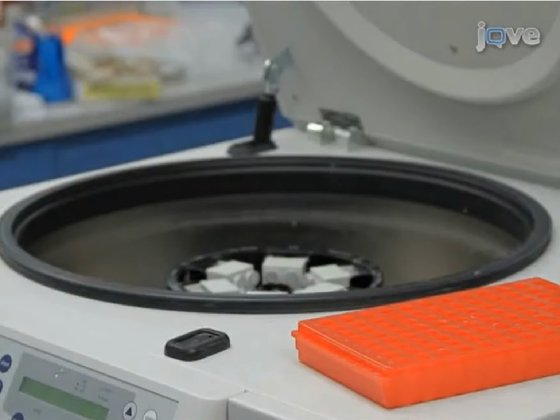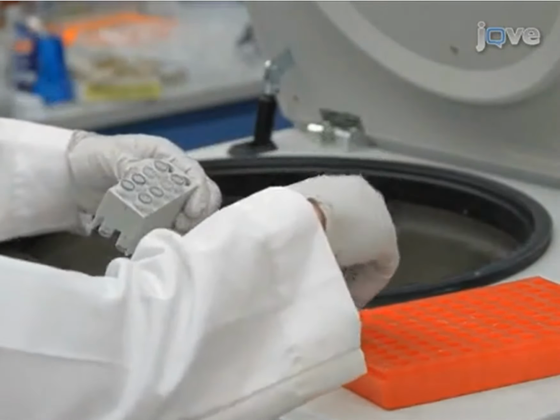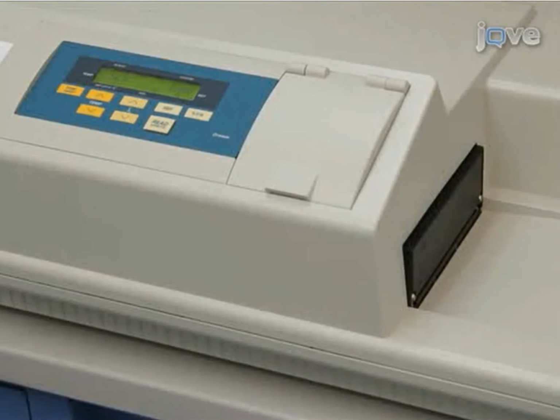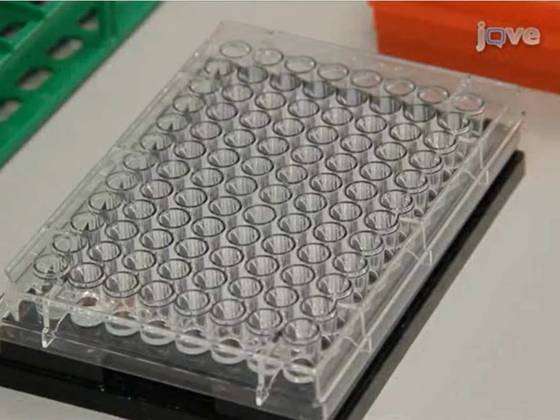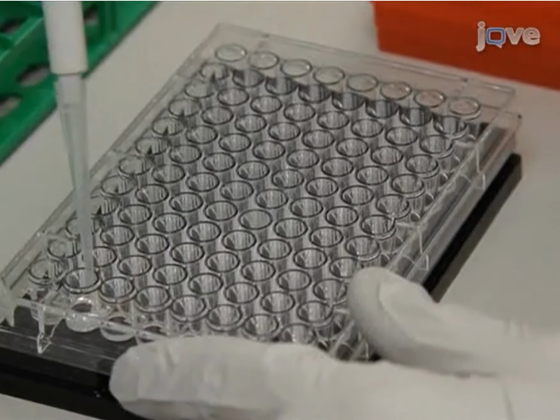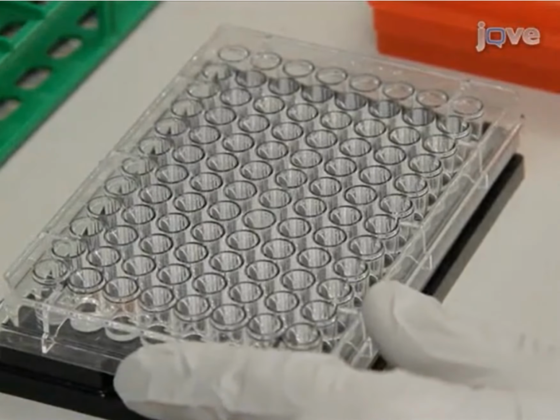There might be some brown insoluble material, mostly lignin, remaining in the tube, while the glucose is in the supernatant. The glucose content of the supernatant is assayed using the colorimetric anthrone assay. This assay is performed in a 96-well polystyrene microtiter plate. Prepare a glucose standard curve in duplicate, following the instructions in the accompanying written protocol.